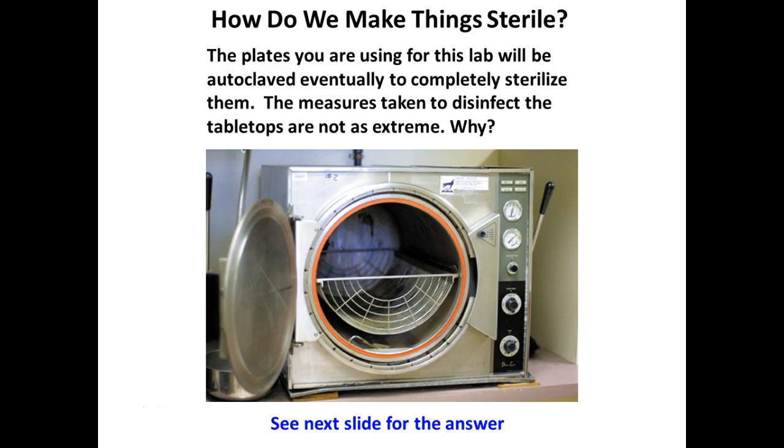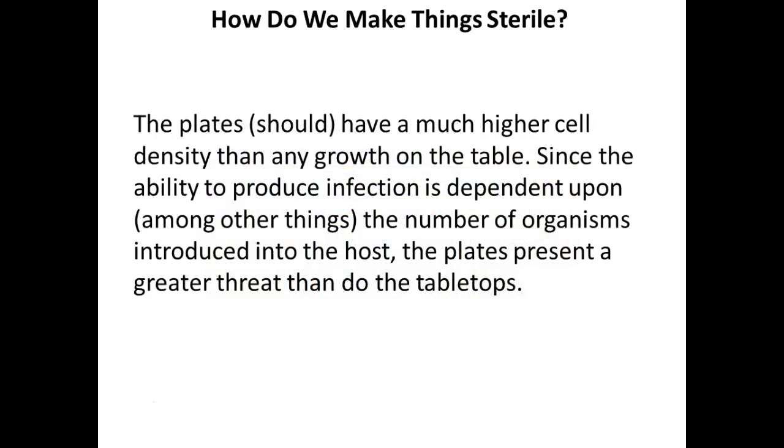Okay, so why don't we do this for our desktops? Why don't we pick these up and autoclave them? One, they're definitely not going to fit. Do they have large numbers of microorganisms? Not large enough that we would need to autoclave. But they do have quite a bit of organisms, which is why we disinfect with Lysol, and why we don't set things like the lids and caps of our Petri dishes onto these, because we would pick up contamination. Make sense? As we've already shown, this is going to be a source of contamination, so we need to limit our contact with the desktop.